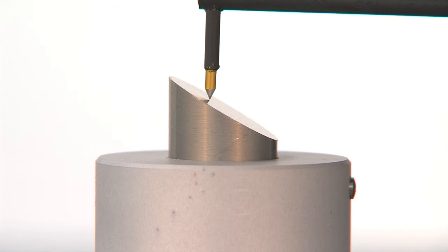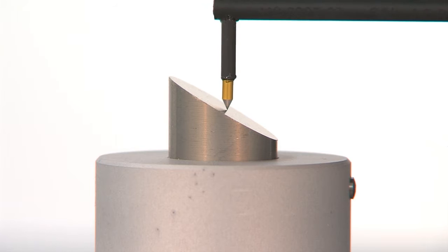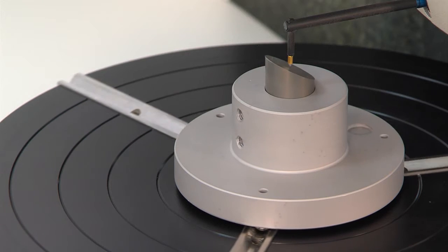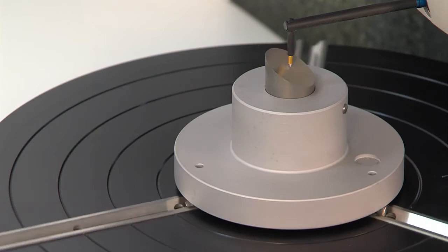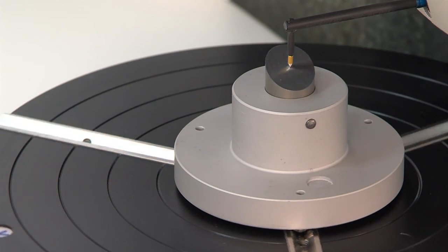The PGI Matrix uses a sloping standard to define the centre rotation to within microns, critical in enabling the automatic measurement of batches accurately.